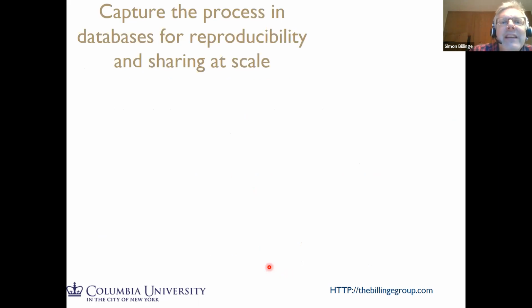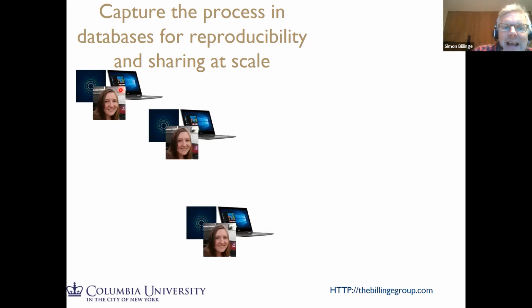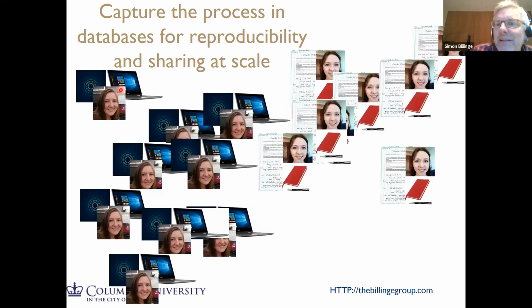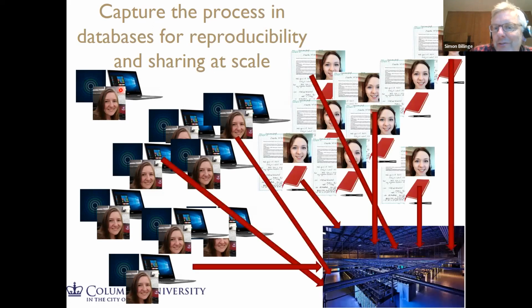And when we're thinking about this in terms of databases, we really want to be capturing, in my view, the data as the autonomous experiment happens. So if we have an experimenter who's doing the experiment in one lab and they're saving the results on their laptop, and then another one in another lab and another in another lab, we can't get any economies of scale. And if we are even using lab notebooks and writing them down in thousands of labs, we don't get these economies of scale. But if you have some kind of centralized data store and you have a structured way of saving it, and the data goes into there, you get enormous economies of scale, and you get these dramatic speedups. And so we really need to think about it.